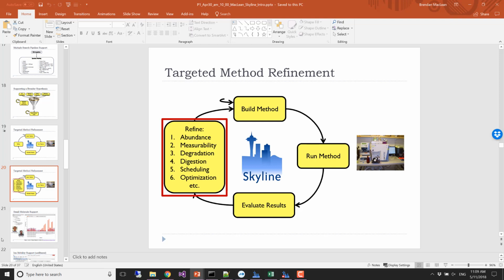If I give her a document where I have only peptides where I could achieve a low CV, how is that going to work statistically for MSstats versus a document where I give her just everything out of the DDA library to the best of my measurement? And I'm using mProphet to tell me whether or not I could measure something. If I could measure it, below a Q value of 0.01, then it goes into the statistical tools. And so that was the interesting genesis of why we're looking at this data today.